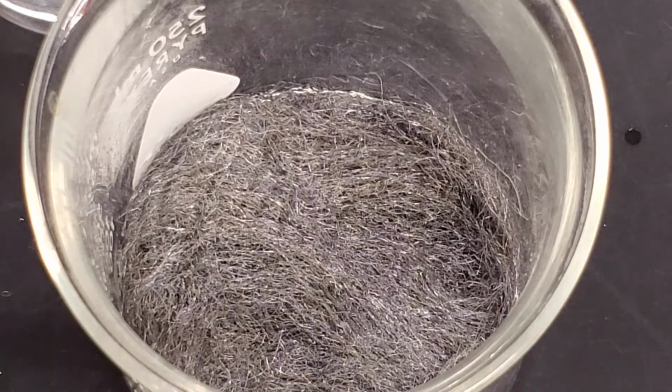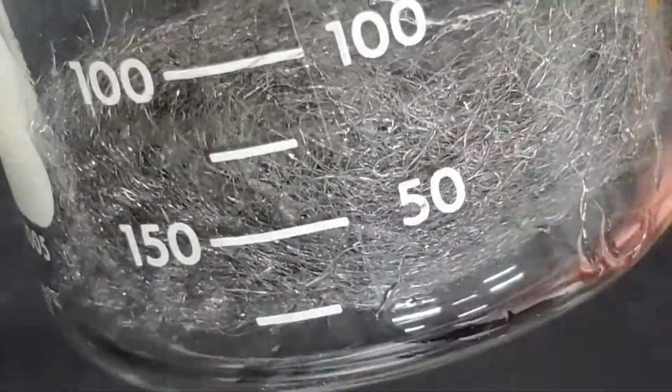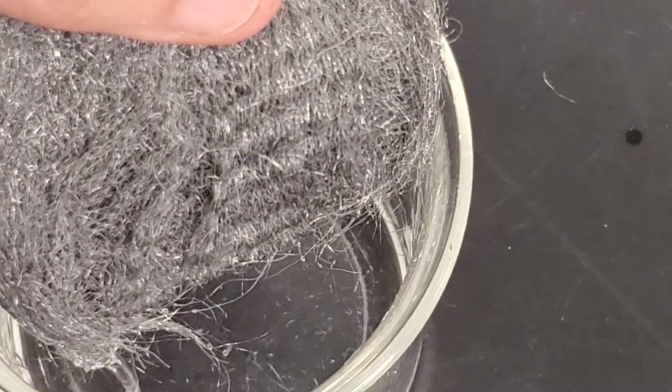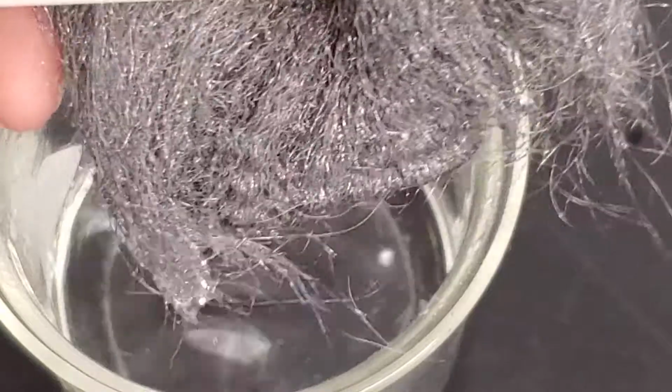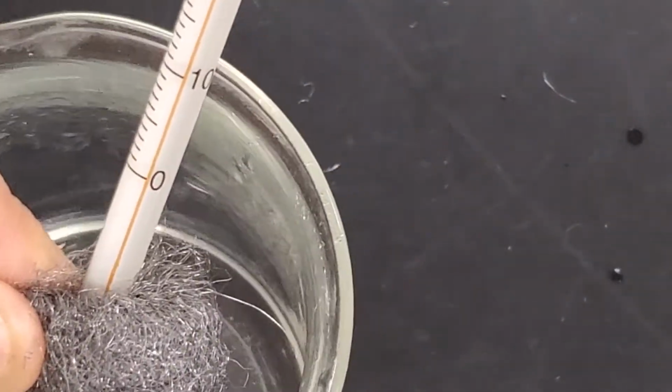All right, let's first check and see if there are any changes or indications that a chemical reaction might have taken place. So you're doing your best to check for any changes from what you would expect or from what we saw originally. We can pull this out and check both sides here. And then we are to wrap the best we can the steel wool around our thermometer without applying any heat from our actual fingers.